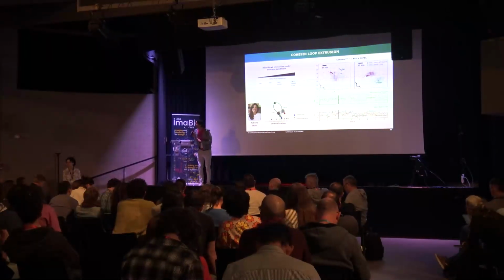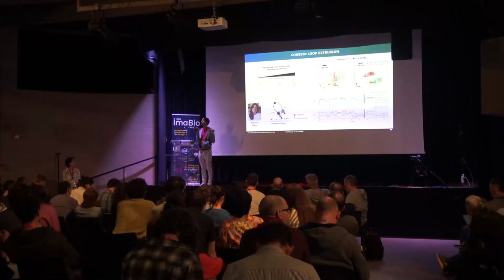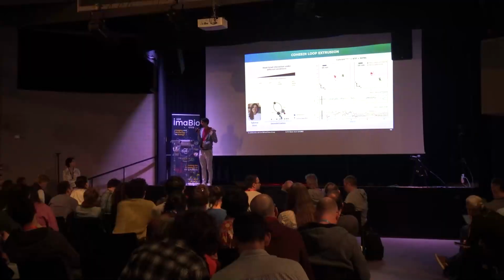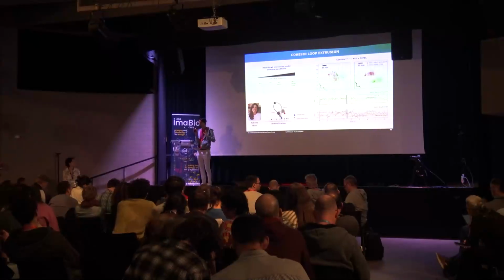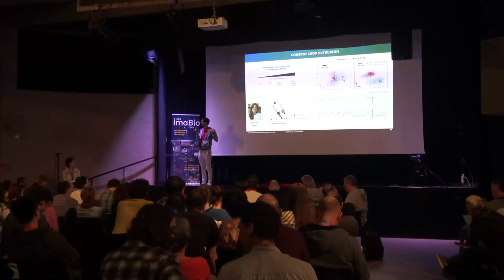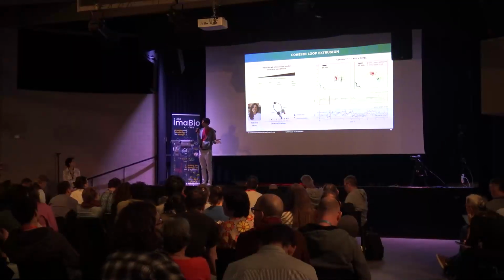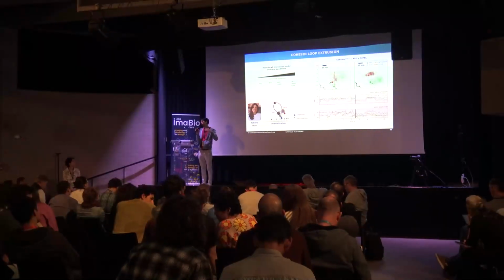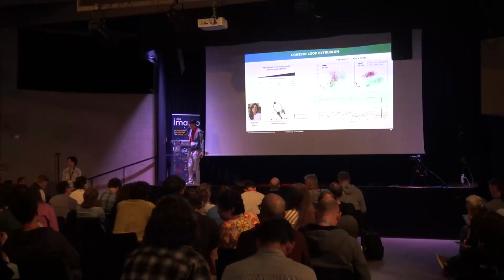The time resolution depends on what spatial resolution we want to have, because you have a trade-off there, and you can choose in post-processing what you want to do. We are normally sub 10 milliseconds easily. We don't need more because things are not so fast. We care more about where in 3D both molecules are. And of course, we have in the pipeline to put more molecules in there. Our goal here is to first identify the conformational changes and their kinetics with and without certain partners, and one day do this on top of an extrusion assay. One day.